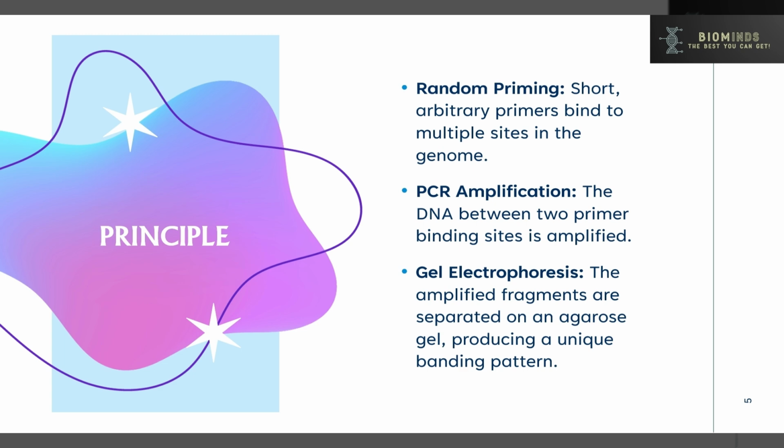Next, we use the PCR amplification technique. Just like the PCR method we have already discussed, it has three basic steps: denaturation, annealing, and extension.